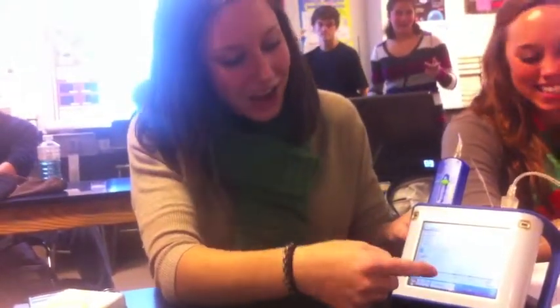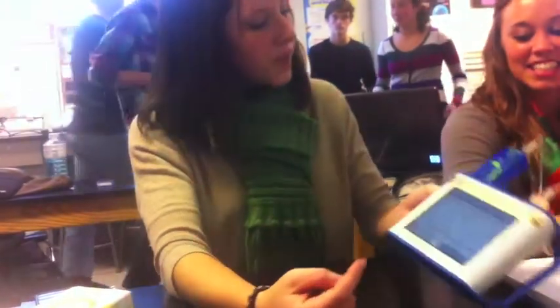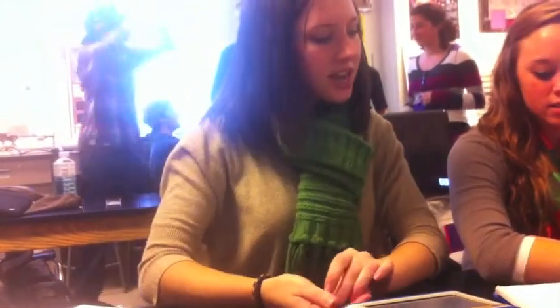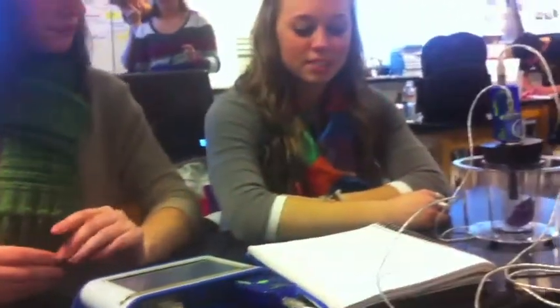But when we did the spinach, you could see that it fluctuated up and down, especially the CO2. And our hypothesis so far is proving to be correct because we said that the green spinach would give off more CO2, mostly because of its color, where the cabbage is purple.